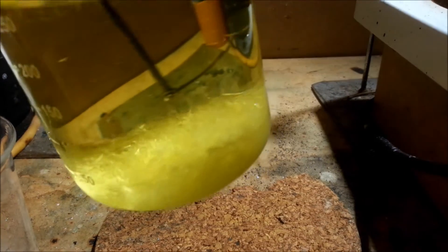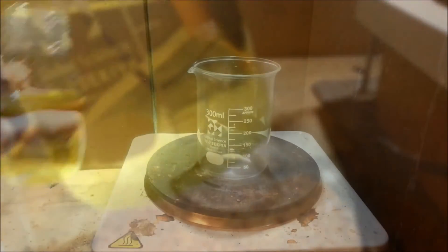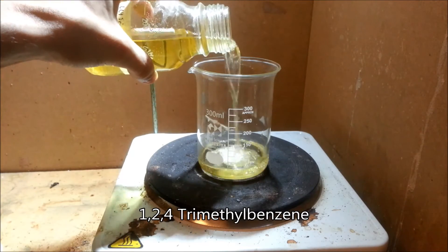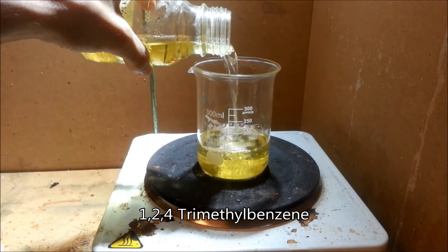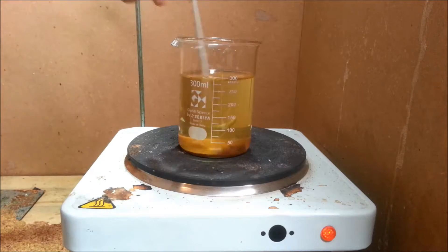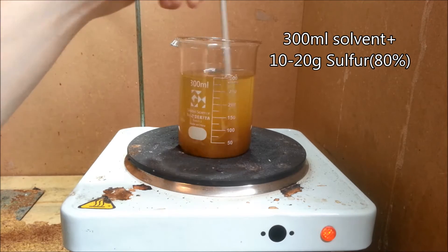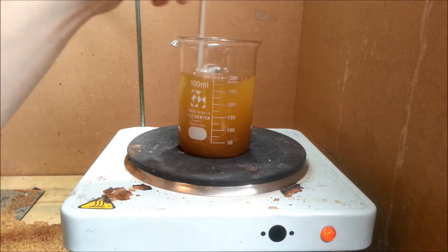Whichever you choose, try to stay well below the boiling point of the solvent to avoid unnecessary evaporation. For my experiment I chose 1,2,4-trimethylbenzene, which has a boiling point of 169 degrees centigrade. 300 milliliters were then added to a beaker along with 10 grams of the sulfur mix, which in this case was labeled 80% sulfur. You may notice the solvent had a green tint, which is a result of previous sulfur filtration.